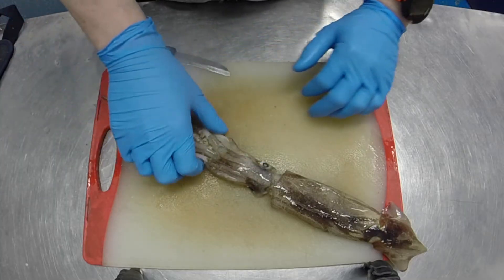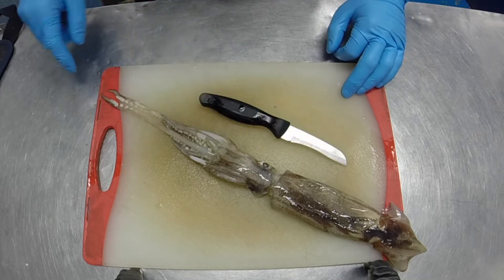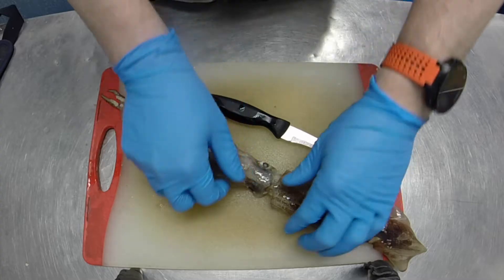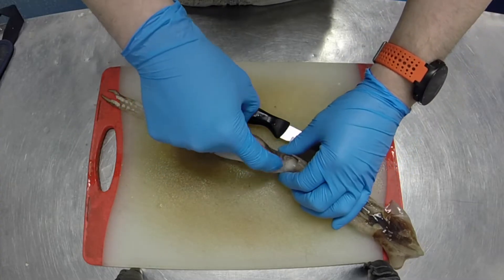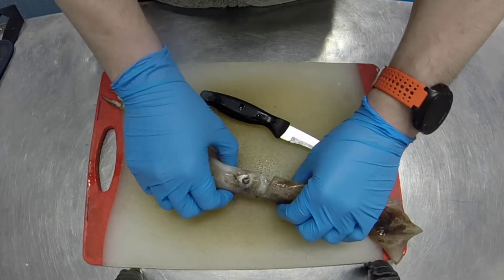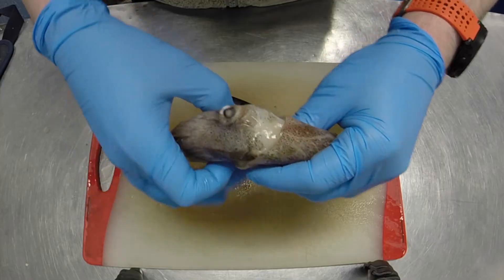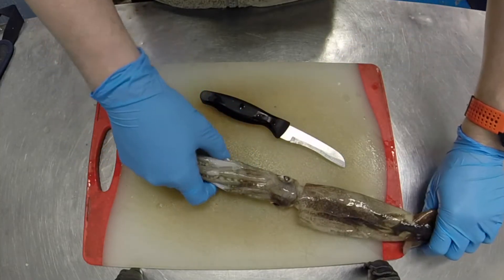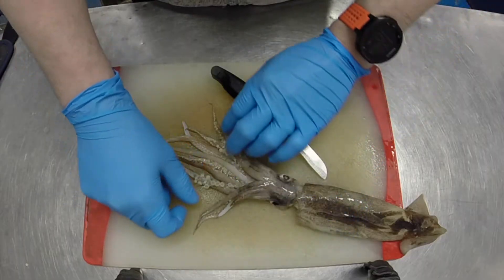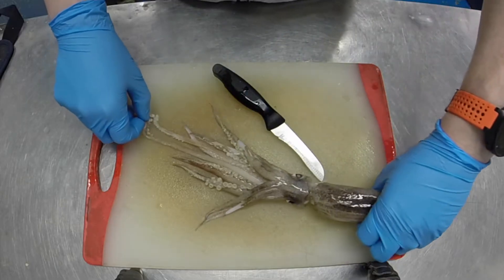This is an Argentinian short-fin squid, commonly found in Brazil and Argentina. You can see immediately they're about a foot long — a very fast-growing species — and they have huge eyes. The eyes of squid, and generally amongst the cephalopod family, are some of the largest eyes in comparison to body size of any animals on the planet. These guys live down to 800 meters deep where it's dark, and they need as much light getting to them as possible, which is why they've got huge eyes.